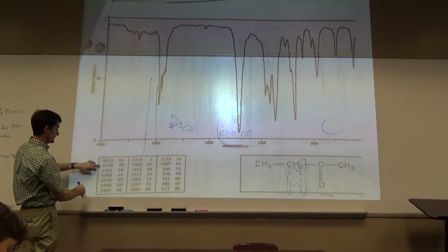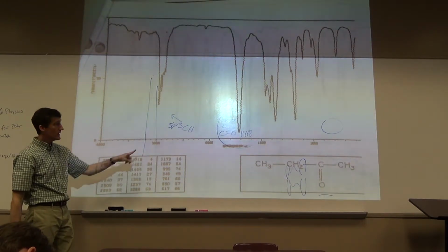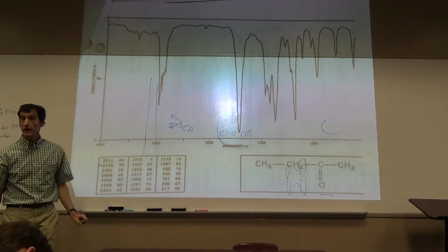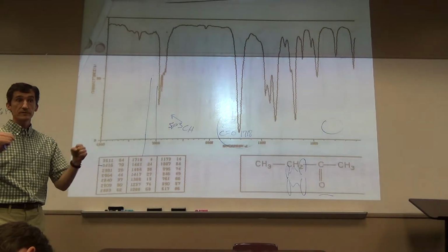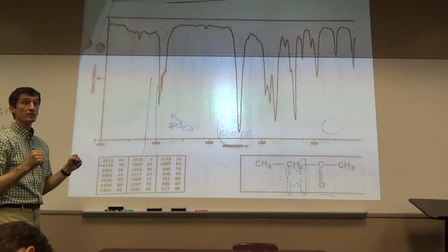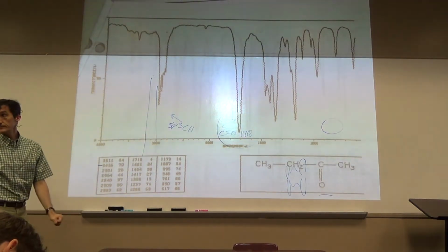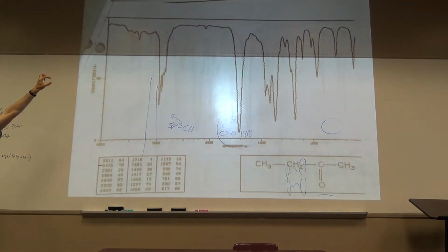What is this peak? 34, 16? You see how it's double minus a touch? And carbonyl is sitting there minding its business. It absorbed, but some of the carbonyls absorbed twice the energy and went way up here. And that's where it absorbed twice the energy.